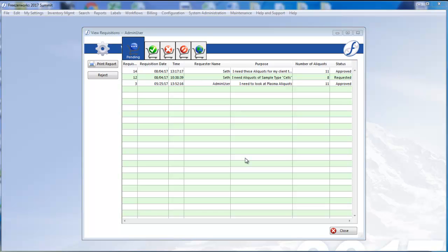If you'd like more information about creating and processing workflows, see our workflows series. Fulfilling requisitions can require e-signatures as well, but we won't have them turned on today. So if you'd like to see how they work, watch parts 1 and 3 of this series.